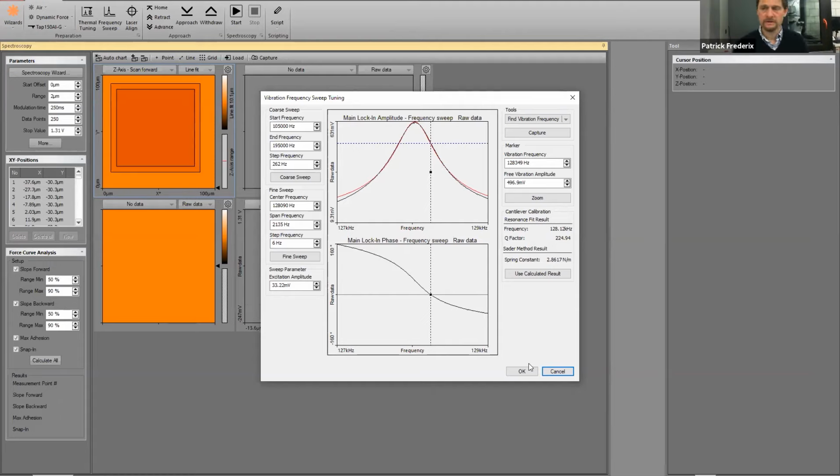A disadvantage is that you have fewer spring constants available. You have them in about 0.2 Newton per meter till about 5 or 8 Newton per meter. So that's a limited range of spring constants. If you take commercial cantilevers like the one I showed, which was based on the QPS cont, that has a spring constant of 0.01 Newton per meter. So you can go there to lower forces.